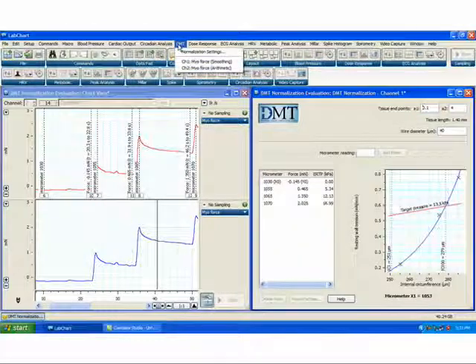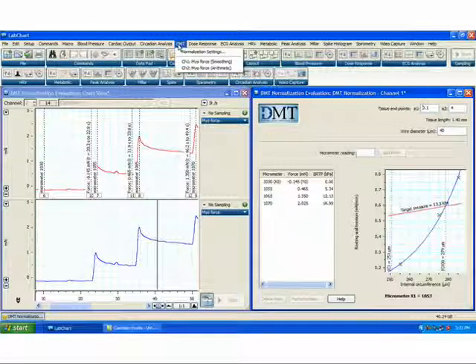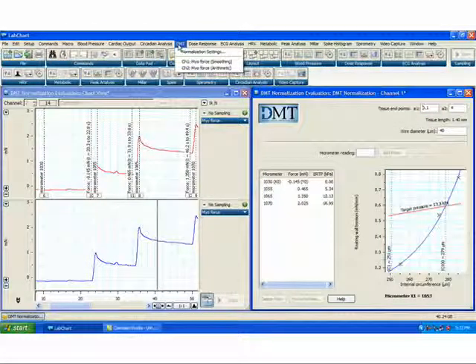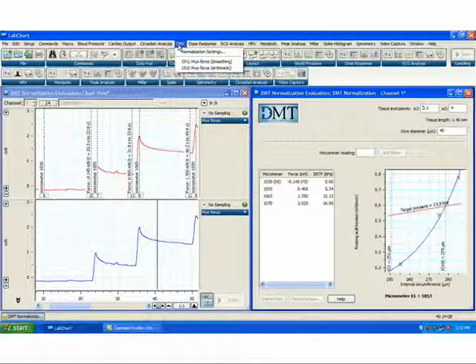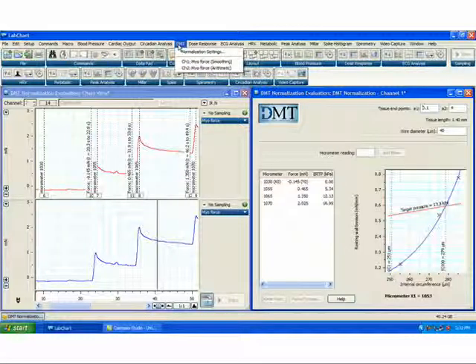The DMT normalization module is a software add-on for LabChart used when performing in vitro experiments on isolated vessels with Danish myotechnology wire myographs.